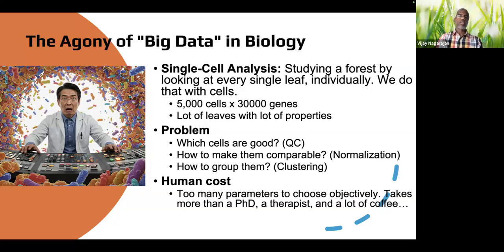Similarly, for normalization, clustering based on a reference, or based on a normal, standard reference that's out there, or based on your domain-specific reference publications. So those are 3 starting steps, but there are a lot of steps you go through after clustering: annotation, differential expression analysis, and then enrichment analysis. That's a standard single cell workflow.